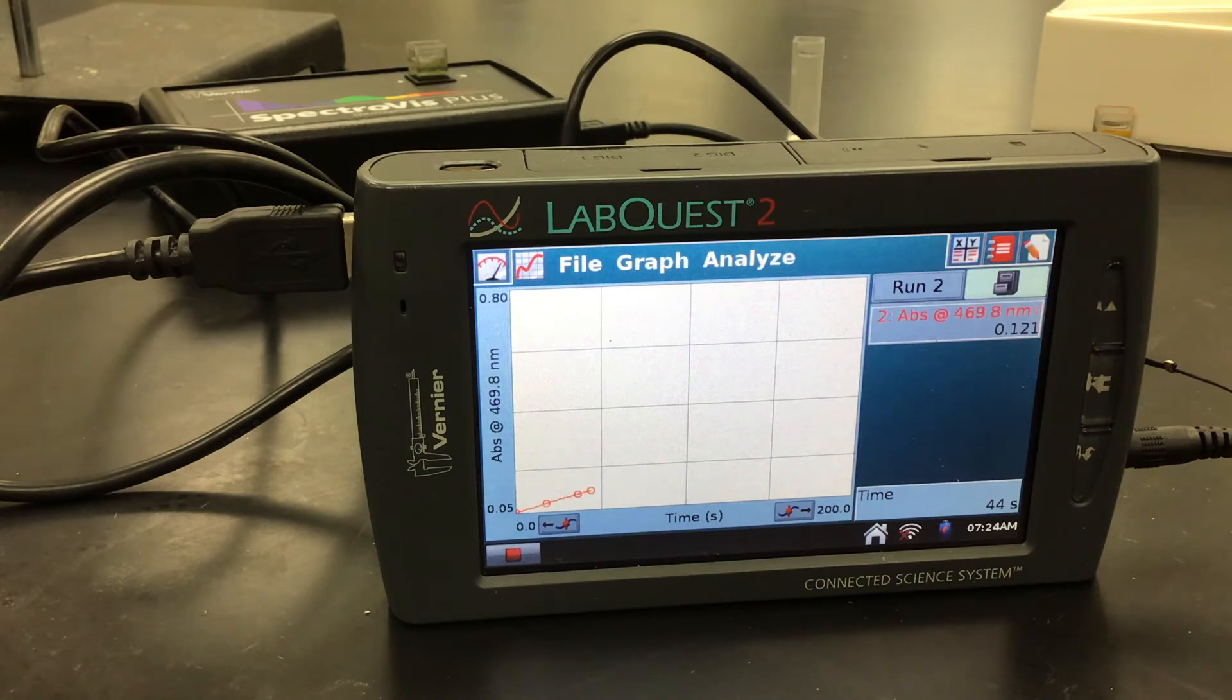All right. We'll let this run and then we'll be able to take a look at our data and I'll go ahead and start this when we have our third trial.